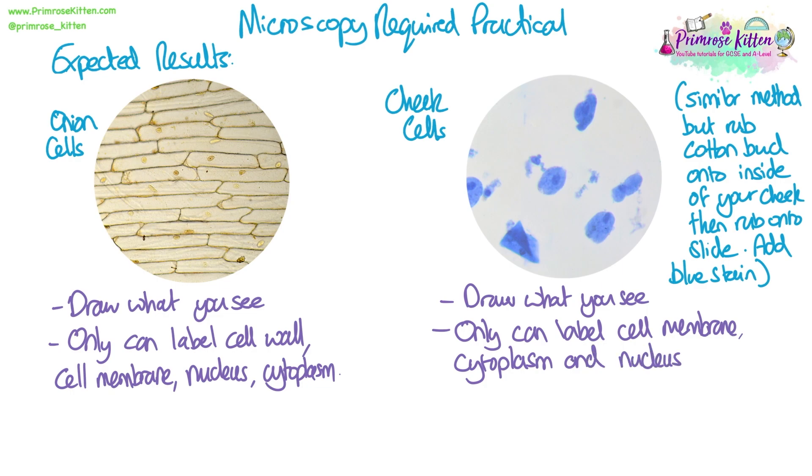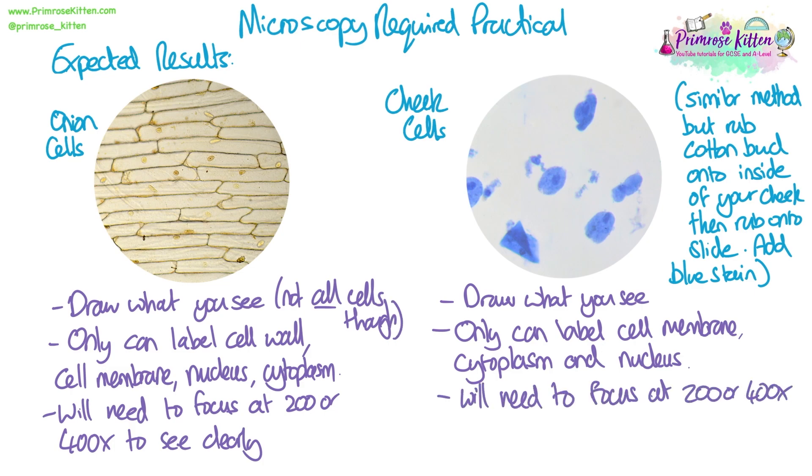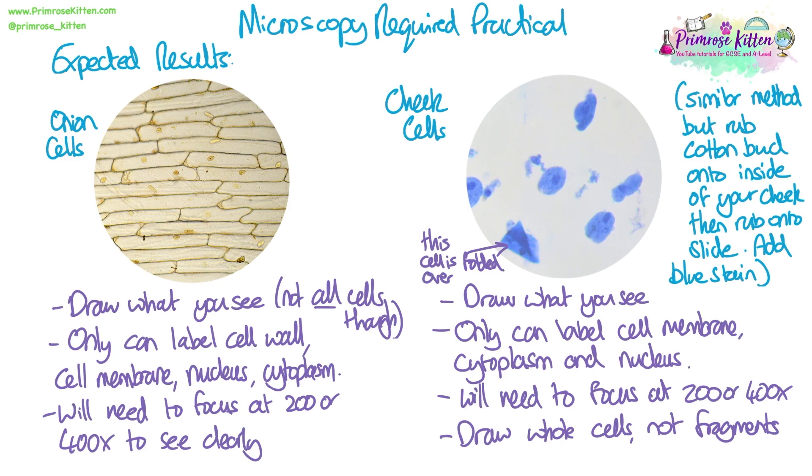To get this level of detail for both slides, you'll need to focus at at least ×200 or ×400 to be able to see and draw exactly what you can see. Make sure you're drawing whole animal cells, not fragments. There are about six animal cells in this field of view — the rest of what you can see are probably fragments of cells or chunks of material that came off with the cotton bud. That bottom left cell has been folded over when the coverslip was placed down. You can press down gently, but if you slide the coverslip you risk folding and wrinkling the cells, making them less easy to see, so be very, very gentle when putting the coverslip down.